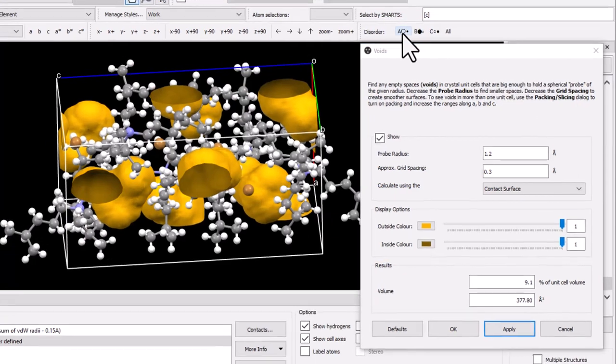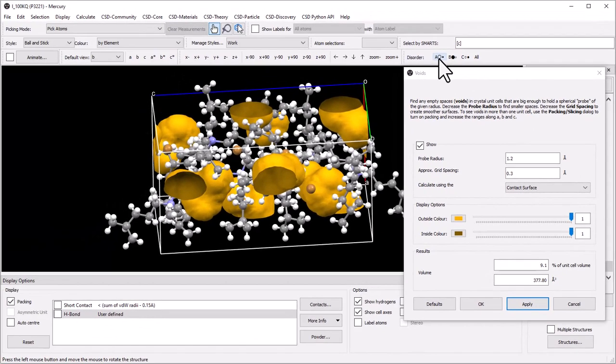In the last part of this video, we will see how the Disorder Analyser interacts with structure editing tools. Bond types are not assigned in CIF files and must be interpreted by Mercury either upon loading by enabling Auto Edit Structure on load, or by processing with Edit Structure, which can be accessed from the Edit menu.